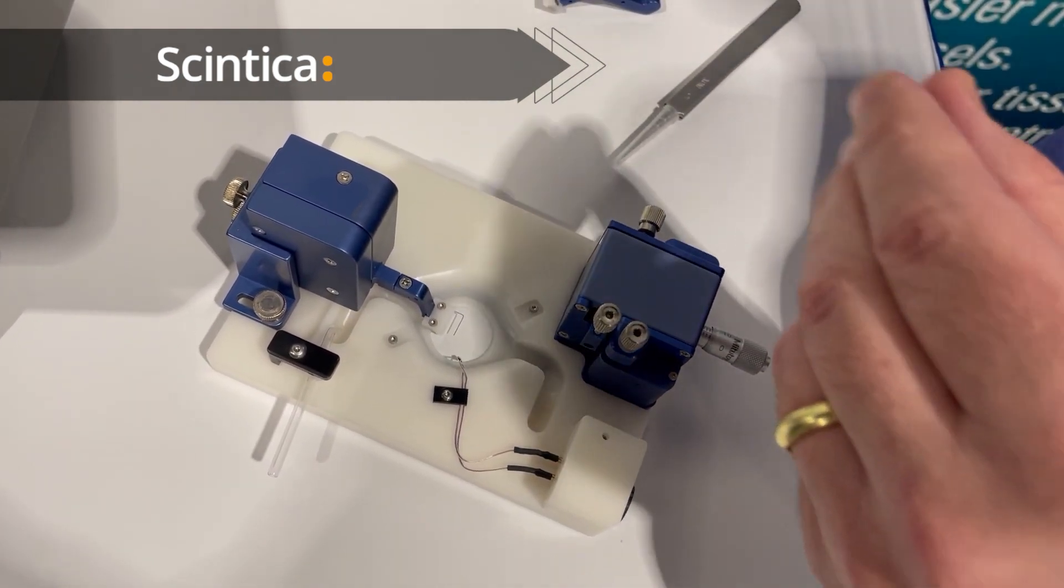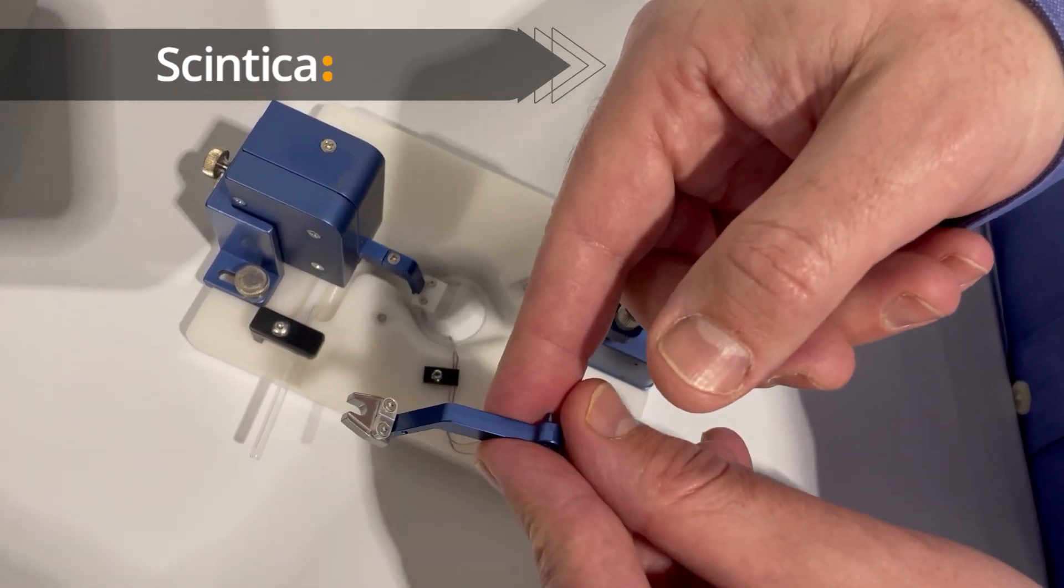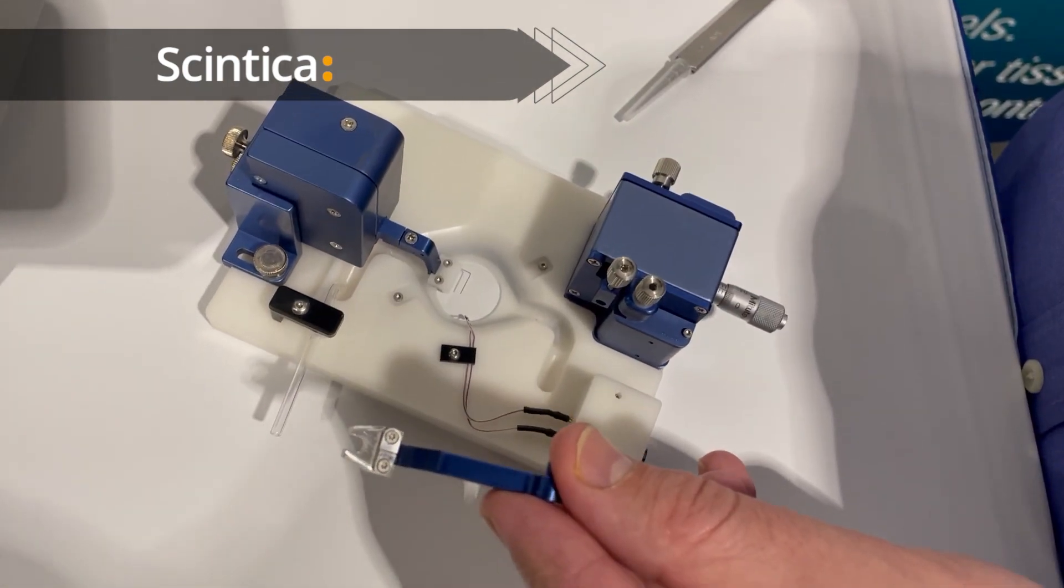Or for micro vessels on a wire mount configuration, we have our micro vessel wire mount jaws that can be easily installed.